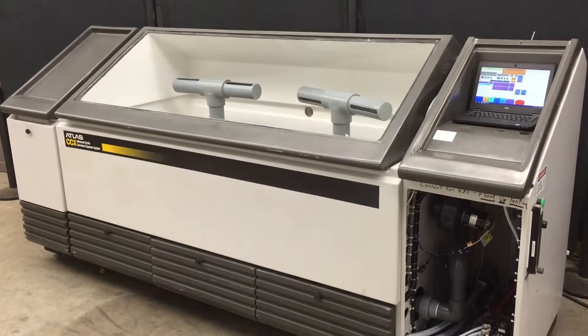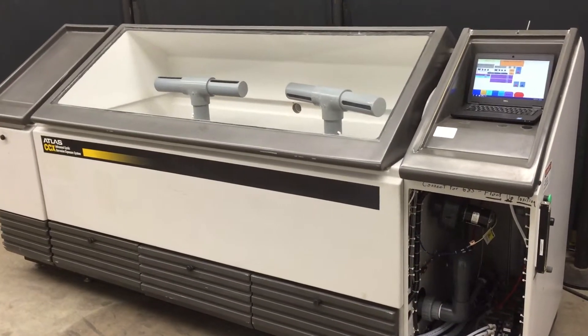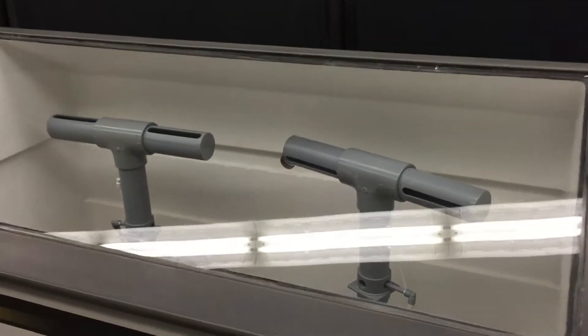Here we have an Atlas cyclic corrosion chamber. This is the 40 cubic foot model.